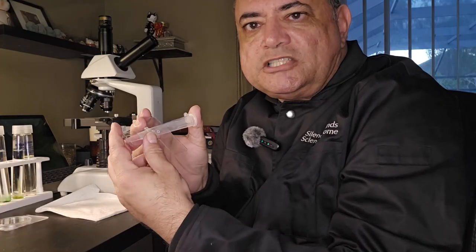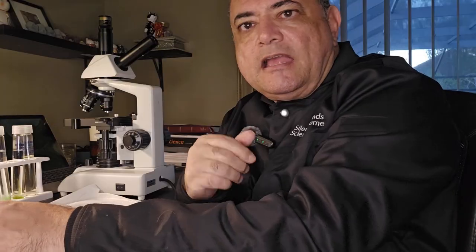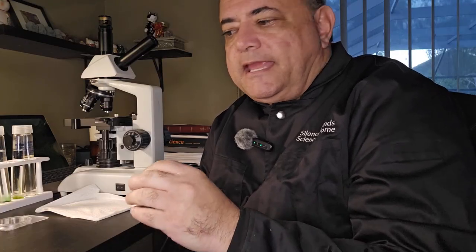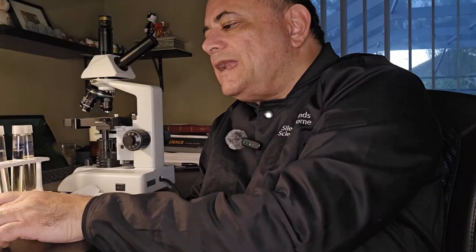The only disadvantage of the demi slide and the Petri slide is that you cannot go under high magnification because the objective lens will not fit over the slides. So what I do is I view them first under low magnification, which usually is plenty.